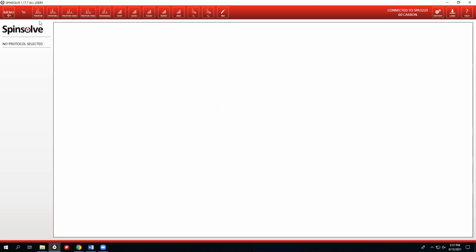Okay, so this will bring up a lot of proton instruments. Even if this is just a benchtop NMR, it's still very powerful. It can even do some two-dimensional NMR. But what we really need here is just a simple proton NMR. So we're going to click the first icon in this sequence, proton.